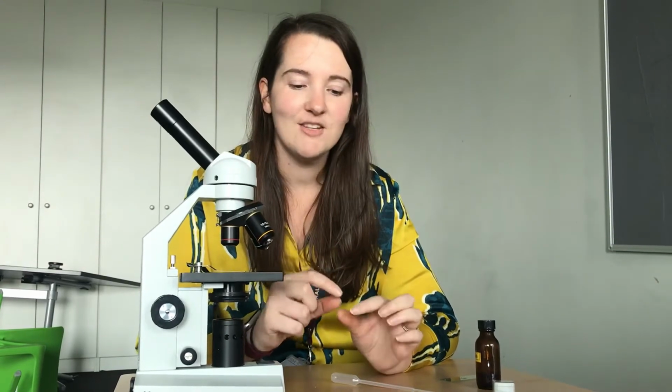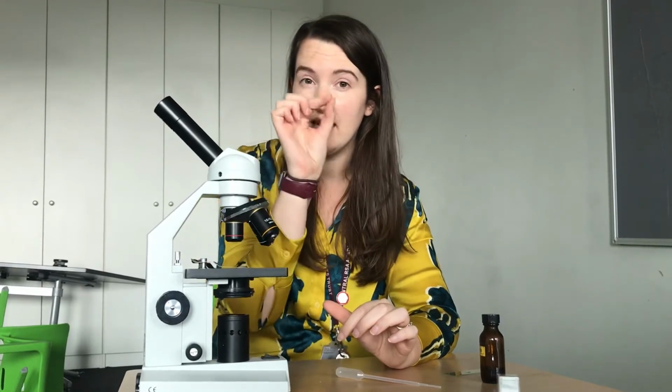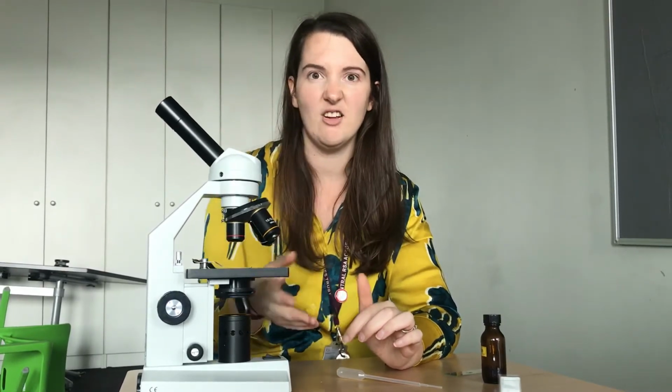So you chop up your onion, and when you've got a tiny piece, you peel off a tiny bit of the thin skin of the onion. And the reason you use the thinnest part is because it's one cell thick. If you were to just put an onion under the microscope, you wouldn't see anything because the light won't go through an onion, but it will go through the really fine layer that you're going to pull off.